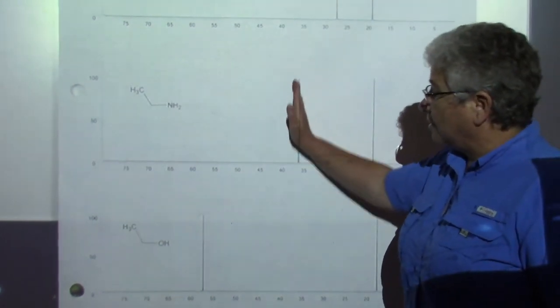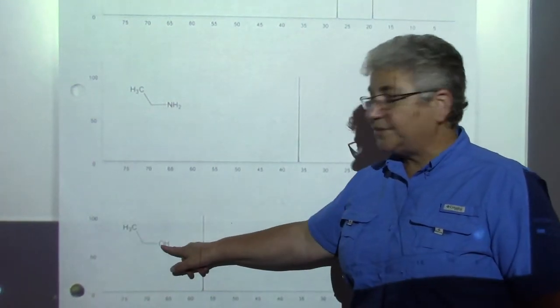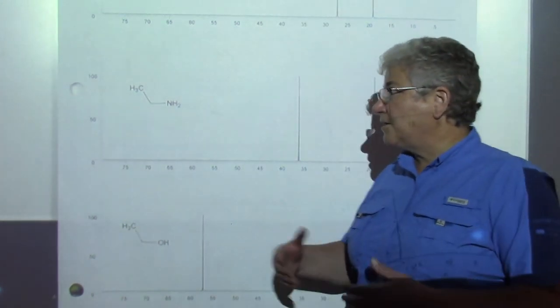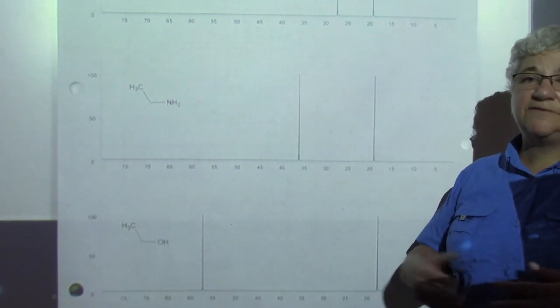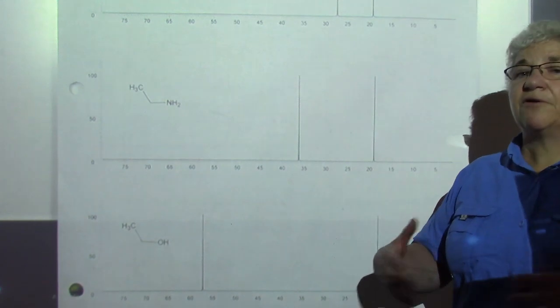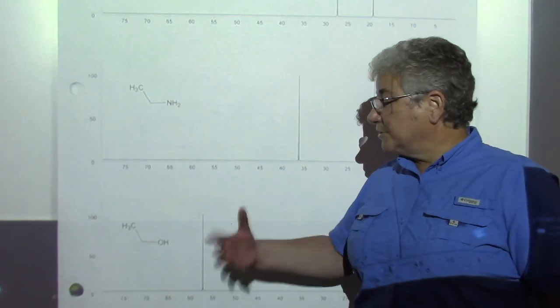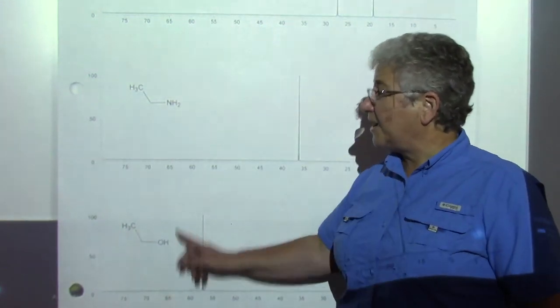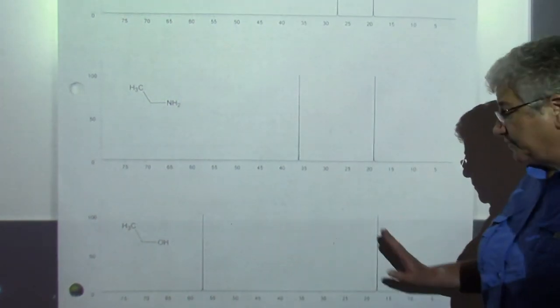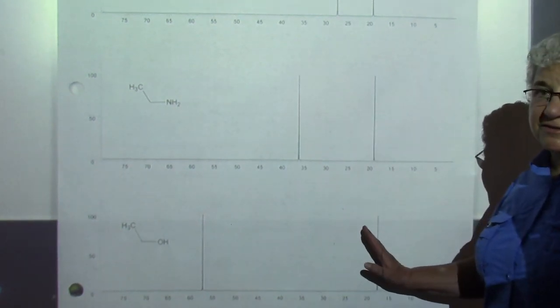So this second carbon is the one that is moving down because the second carbon is the one that's bound to the atom that's changing. And so you might say, oh, maybe this is electronegativity related. It is partially electronegativity related, right? It has to do with where the electrons are in that covalent bond. But what you should pay attention to is as I change the heteroatom from a halide to a nitrogen to an oxygen, I'm really pulling that carbon downfield away from the original alkane-like positions.